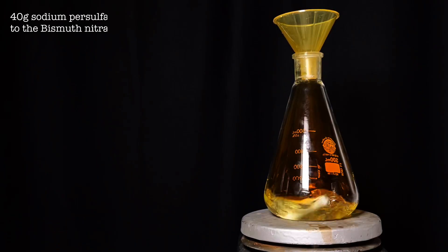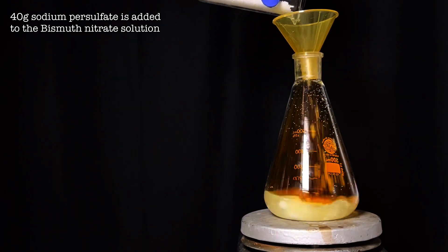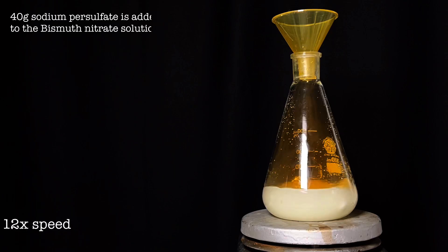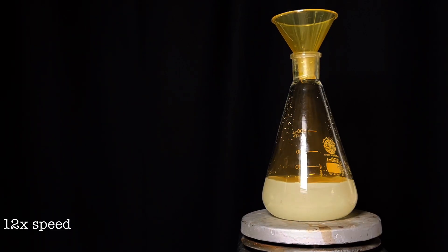Now the previous Erlenmeyer was taken and 40 grams of sodium per sulfate was added to it. If it feels like it is not dissolving, a little extra water could be added carefully.